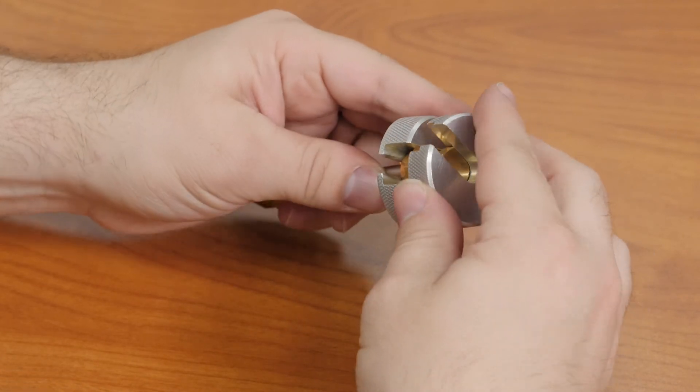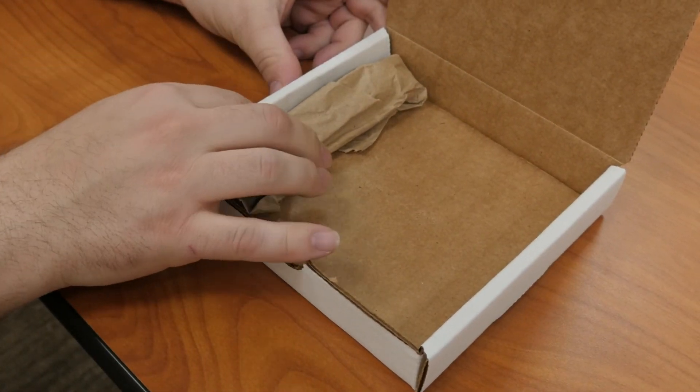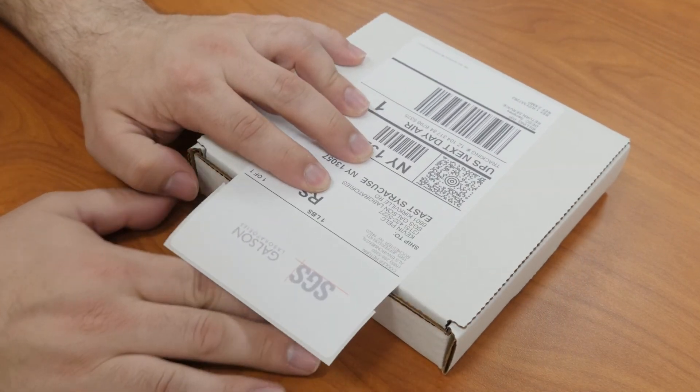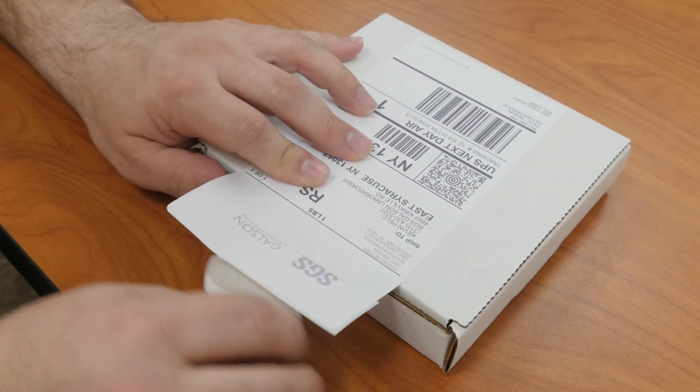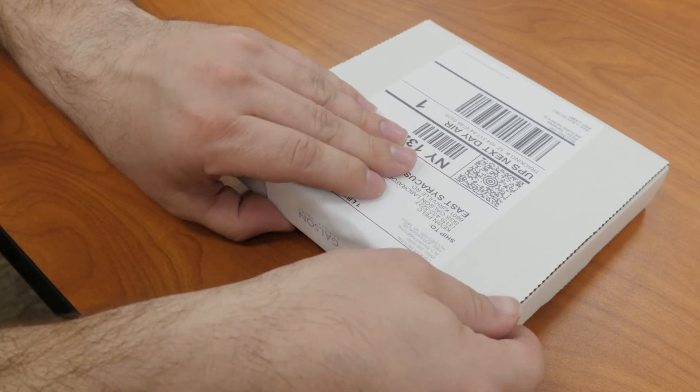Immediately seal both ends of the thermal desorption tubes using the wrenches and original caps. Place the tubes in the provided resealable bags and wrap in brown paper. Place the thermal desorption tubes in the provided pre-labeled box. Do not send any paperwork or wrenches with these tubes. Your chain of custodies will all ship back to SGS Galson with the remainder of your samples.